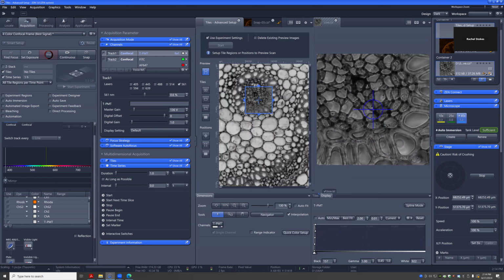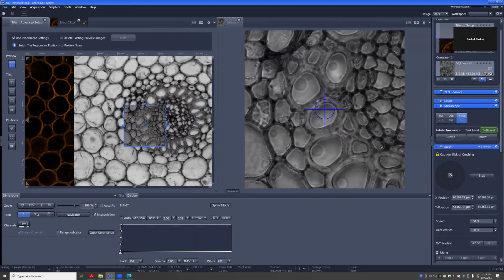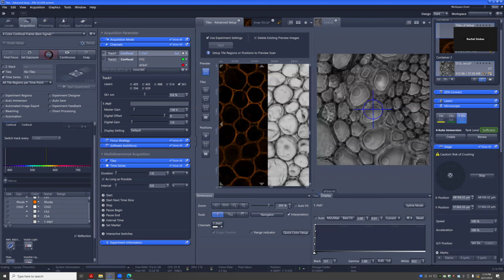And you can see right now, this is a 40x field of view, so everything kind of shrank down. But that's fine. This is why I like to take these overviews. Once I'm on that higher mag objective, you can use that as a reference, so you can always pick out the interesting spots on your slide when you're zoomed up on the higher magnification. So that looks good. So we should move into area scan. That's kind of our final chapter.